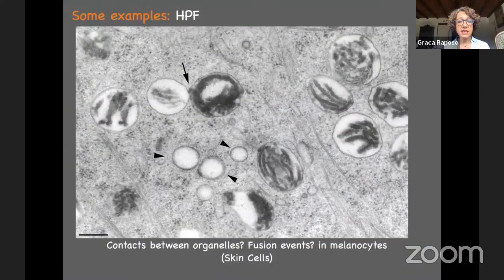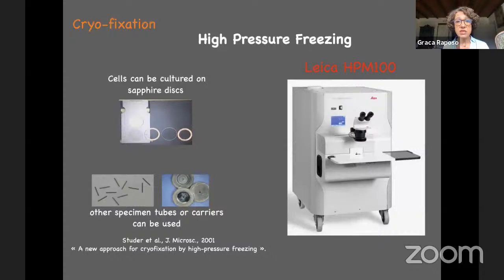So here, this is again an example. You can see here very, very close contact. Can we detect maybe a fusion event between? I'll come to that later to show you how we can do it. But you can see here also very nicely, for example, microtubules and all these vesicles around with the optimally preserved volume. So this is how it is.